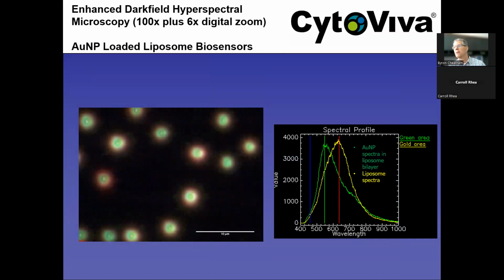Looking at liposomes again, and polymers and liposomes being shown as the first two examples, it's not an accident. Lipids, liposomes, the LDL as a lipid, polymer nanoparticles have been the most approved materials that we've seen from a drug delivery perspective.